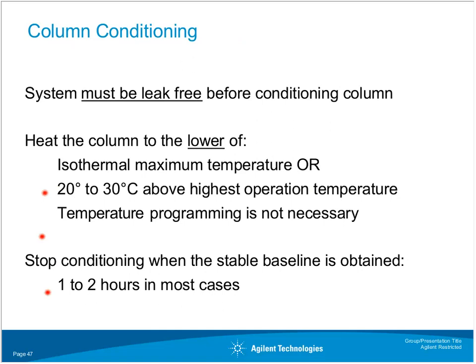You want to do that for 1 to 2 hours. 2 hours is typically the most consistent time. Really don't need any more time than that. And you don't have to program it there. I know I run into a lot of people that'll program at 5 degrees a minute to get up to the isothermal limit, leave it there for two hours. Some people do it overnight, which can not be good, especially if you have a leak. But 2 hours should be sufficient. You don't have to temperature program it. I just walk up to the GC, key in the temperature, hit enter, let it do its thing, come back in 2 hours, and I'm good to go.